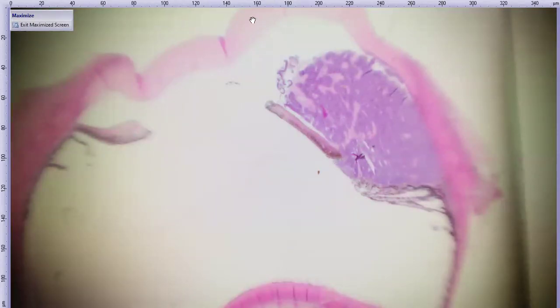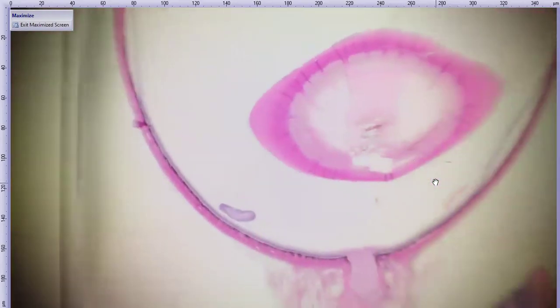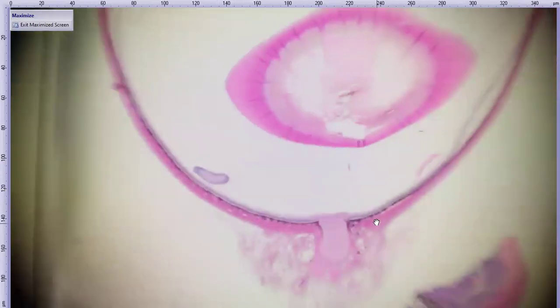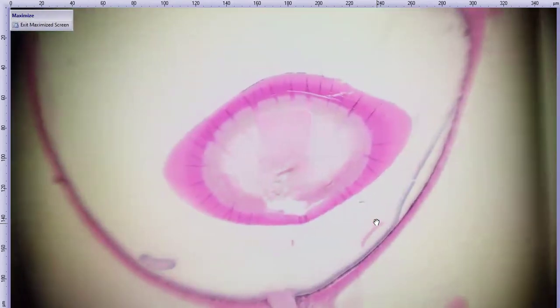All right, so cornea is up top, looks pretty good. We have one little iris leaflet in our ciliary body on this side, which look relatively unremarkable. And then here's the mass itself. It's very purple. And as we saw grossly, it is at the base of the iris involving the ciliary body. And then we have at least one of those little tufts of cells hanging out in the vitreous here that we saw grossly. And then everything else, so optic nerve head, retina, lens look relatively unremarkable. So when we pop this on the stand, probably won't go over those in great depth.